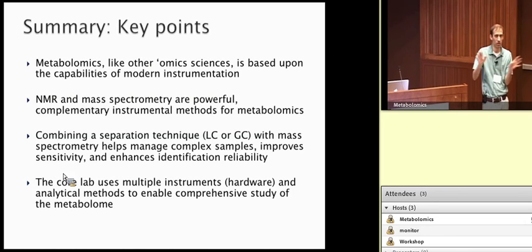So with targeted, you generally don't have to worry about that. We know what signal to look for. It doesn't matter what fragments are being formed. Usually the proportion of fragmented to unfragmented metabolites is very consistent in mass spec, so we can just pick one and quantitate on that. In the untargeted, it's more challenging.